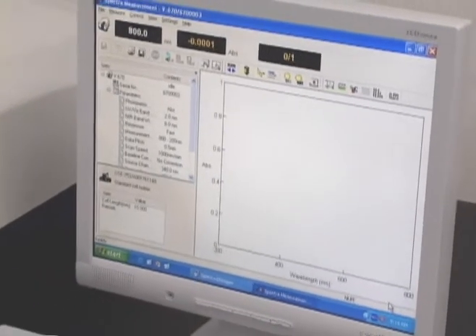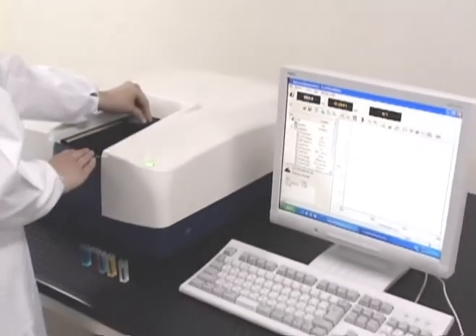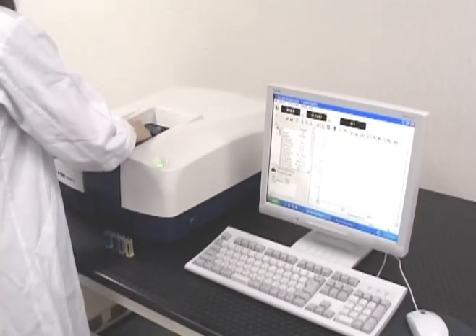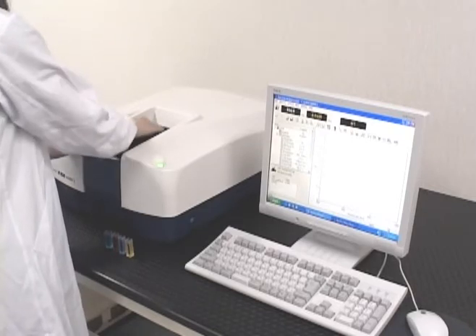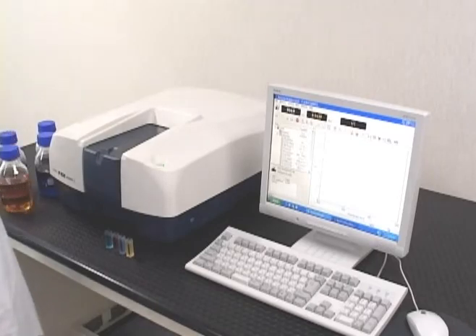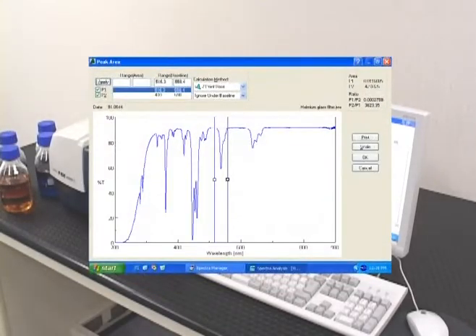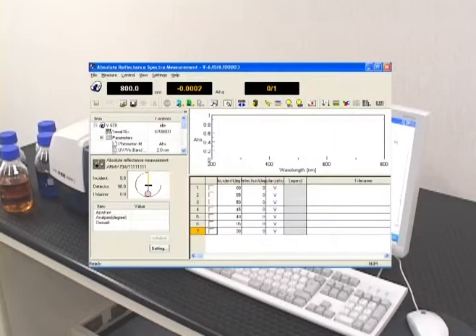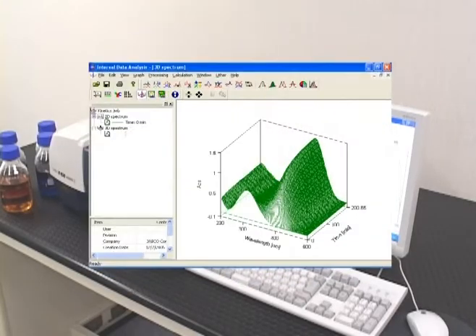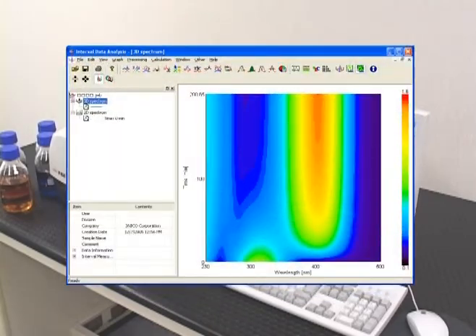Spectra Manager 2, the latest version of JASCO's innovative cross-platform spectroscopy software, provides full system control and advanced data processing. Spectra Manager CFR is a 21 CFR 11 compliant version, available as an option. Both software packages are designed to provide easy operation and the ability to perform a wide range of applications from routine to sophisticated procedures.